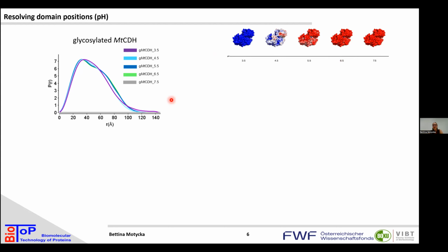And there is the approach that you can say you take only one model to reconstruct, or you can have a two-state model or three-state model approach.